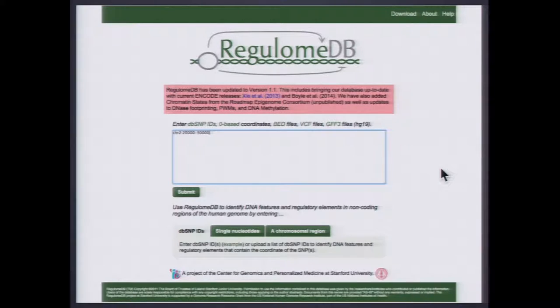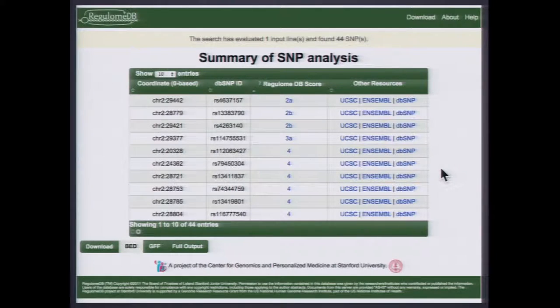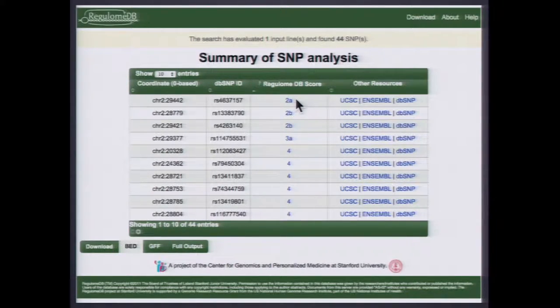If you enter this region into RegulumDB, you get an output showing 44 different SNPs that are in this 10KB region. It ranks each one of these SNPs by a RegulumDB score. This score is based on the amount of different analyses and number of different lines of evidence that intersect that particular SNP.